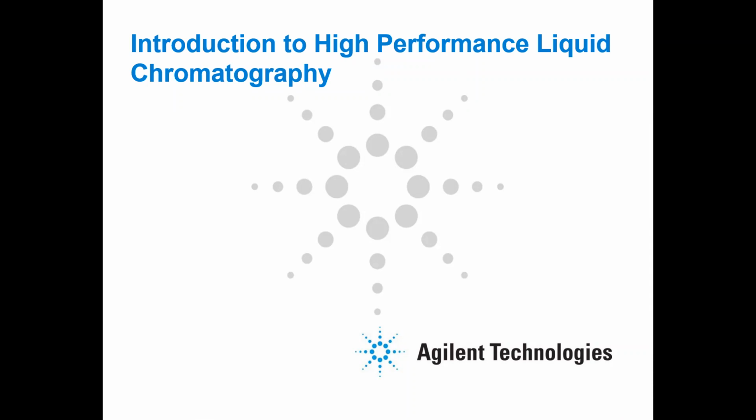So the detector, for example, if I'm working with chromophores that will absorb at a particular wavelength, I can set my detector to 254 nanometers, and all the chromophores that can be detected at that wavelength will be detected. If there are compounds that can fluoresce, I can also set the emission and excitation wavelength of my analyte, and the elution pattern will be the same. So let's say component A elutes at 5 minutes, then at 10 minutes component B elutes, at 25 minutes component C elutes. So that even without quantifying them, I can know the pattern of analytes that are eluting at different times.